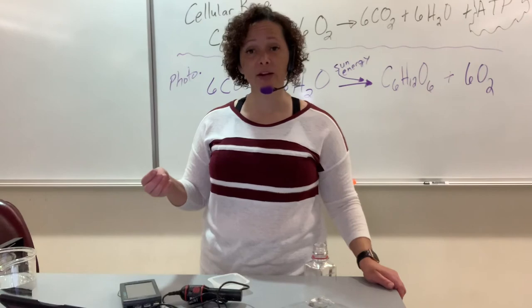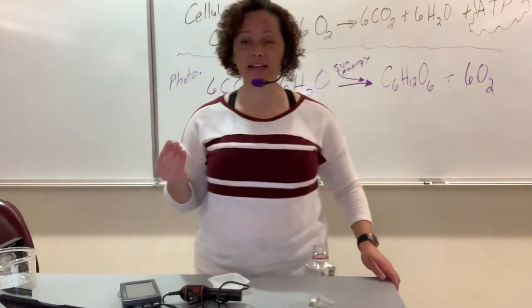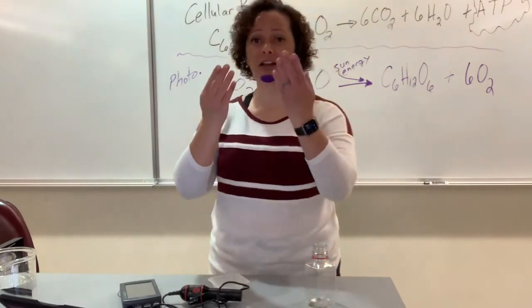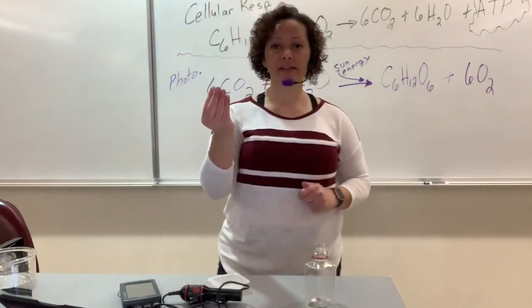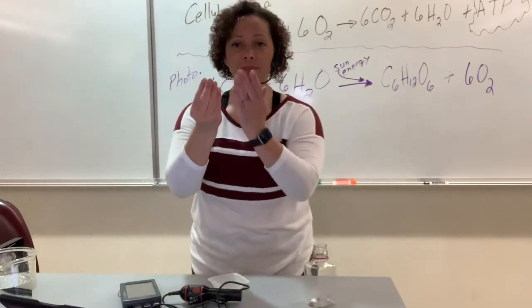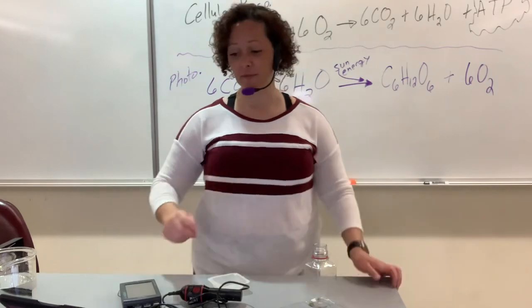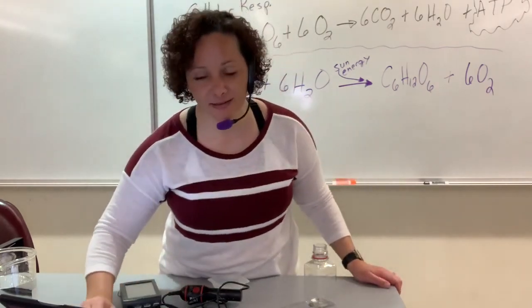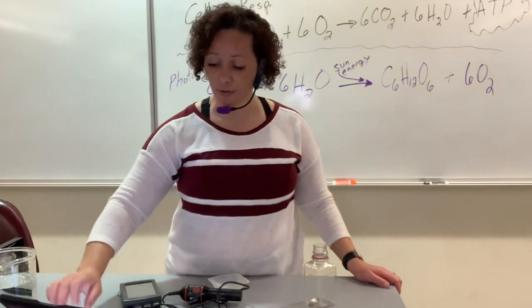So since we are taking average values, animal in the light, comparing it to animal in the dark, boom, boom. Plant in the light, comparing it to plant in the dark, boom, boom. I'm going to let you guess what type of graph you're going to be giving me. I know I give way too many hints. I know I do. So please answer all of the questions accordingly.